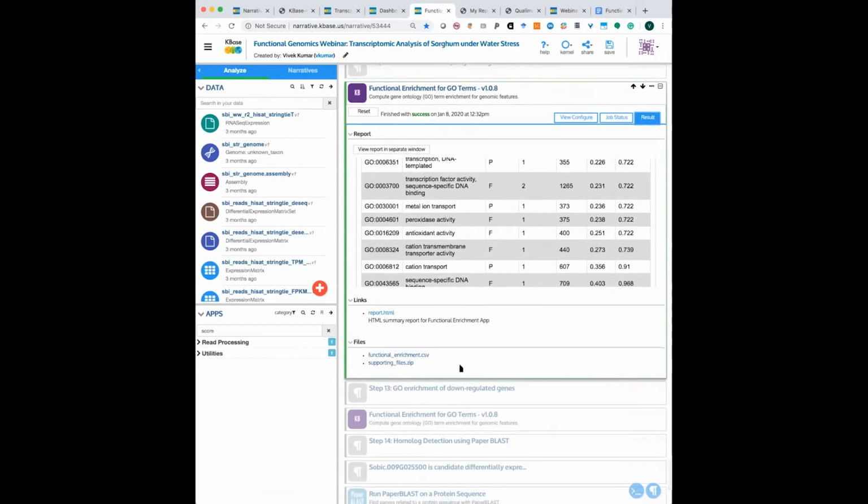So that's the place where a number of research queries will end, where you are able to eventually converge to the genes of interest and what those genes are. You have characterized them, and these are the genes which were upregulated as a result of my drought stress treatment.